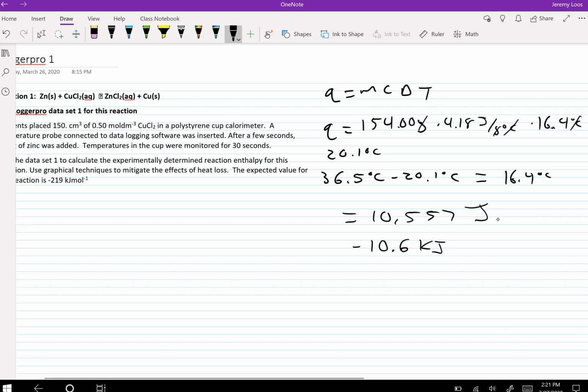And pretty much always, in every situation I can think of anyway, when you use this type of calorimetry, you're going to have to flip the sign. Still, though, our unit is only kilojoules. So there's a little bit more that we need to think about here. So we have our chemical reaction. I'm just going to rewrite the reactants anyway.